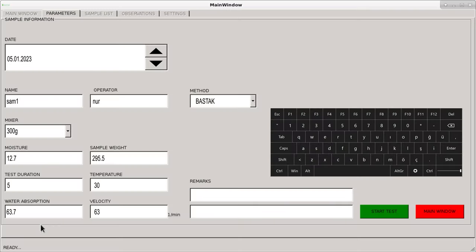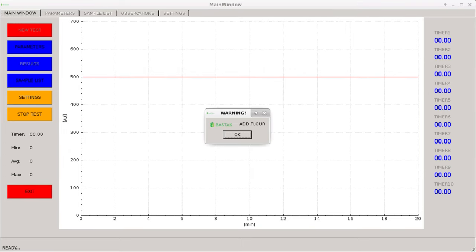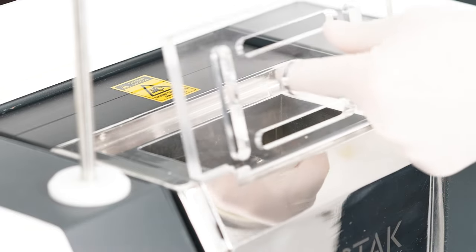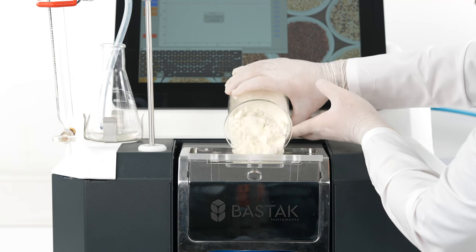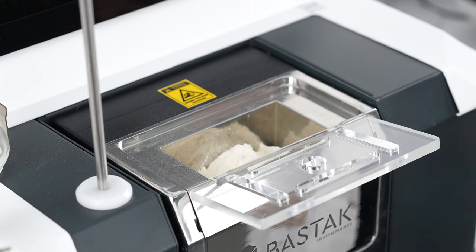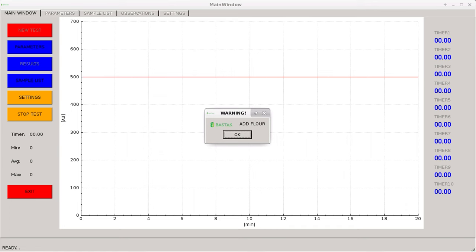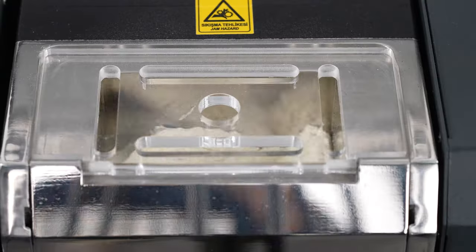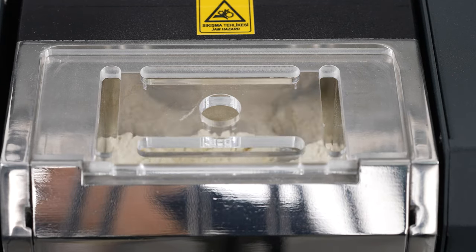Press the start test indicator. The engine of the device starts to run. After 10 seconds, the warning 'add flour' appears on the device display. The automatically calculated amount of flour is poured into the sample container of the kneading unit. Carefully close the plexiglass cover of the kneading unit and press the OK button. The kneading blades mix the sample for 45 seconds for homogenization.